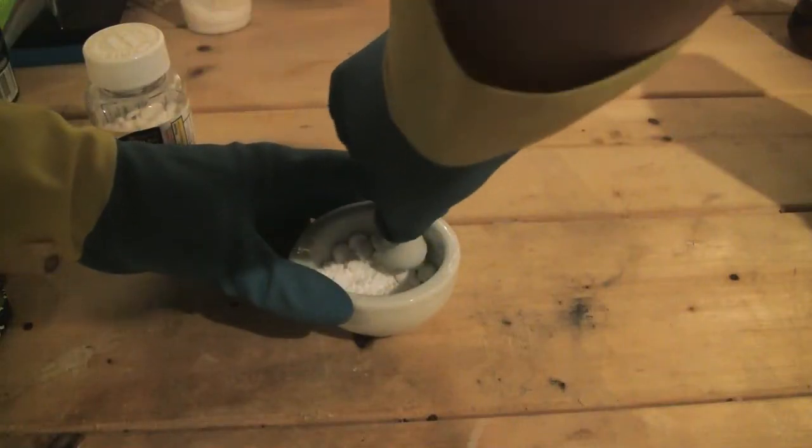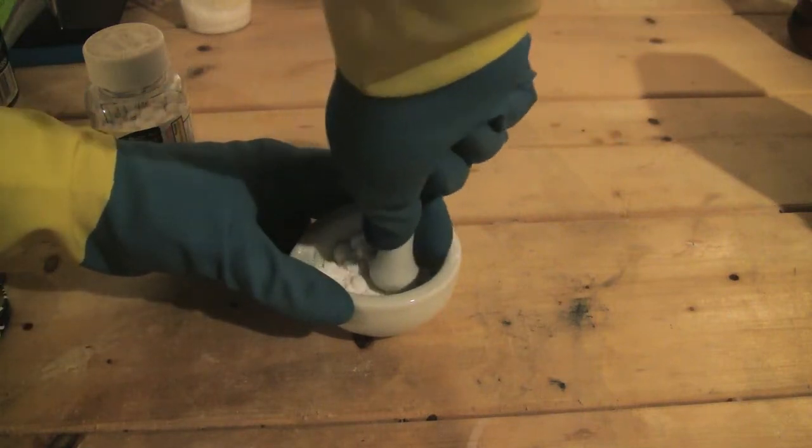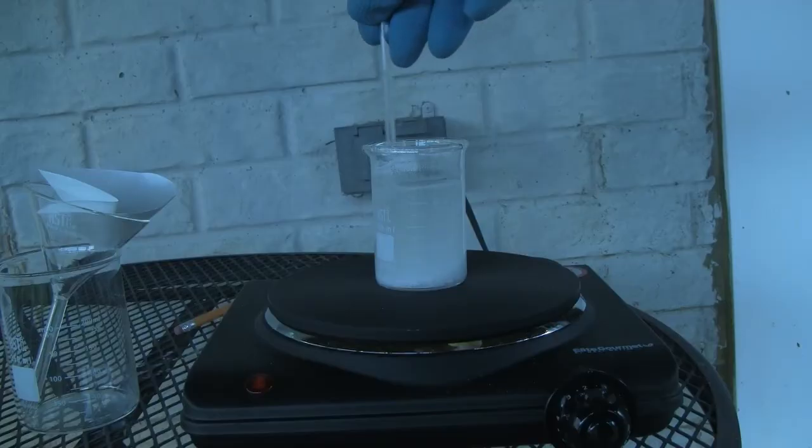First I start by using a mortar and pestle to grind the tablets to a fine powder. Grinding the tablets to a fine powder allows acetone to more efficiently dissolve the ASA.